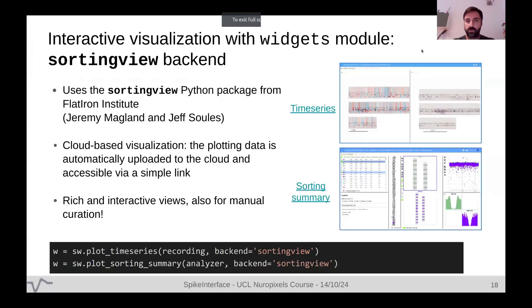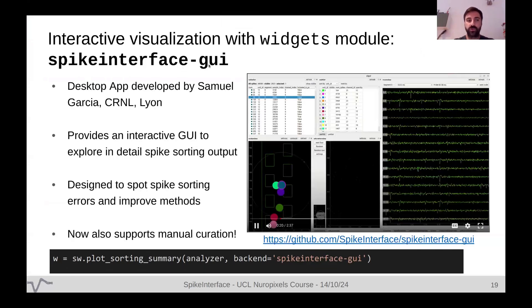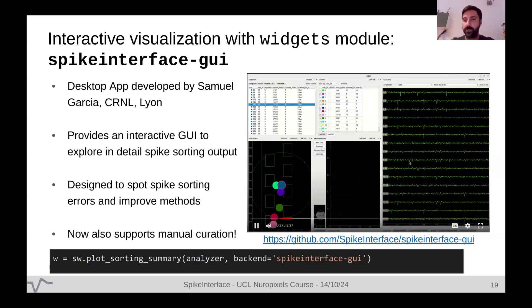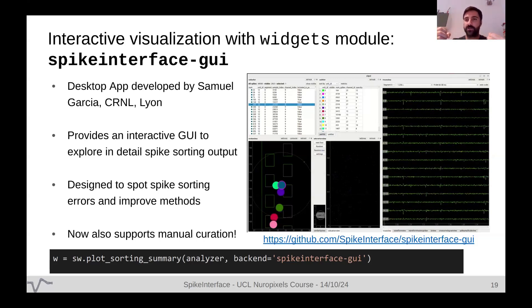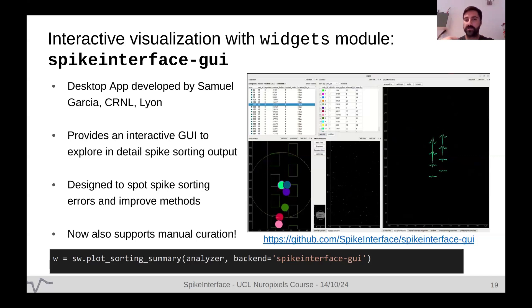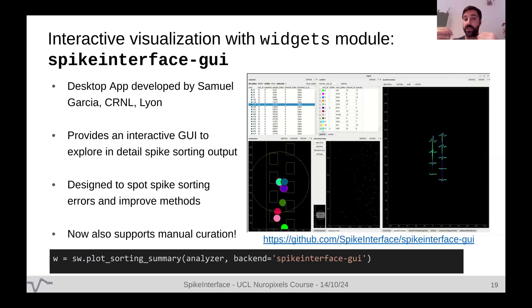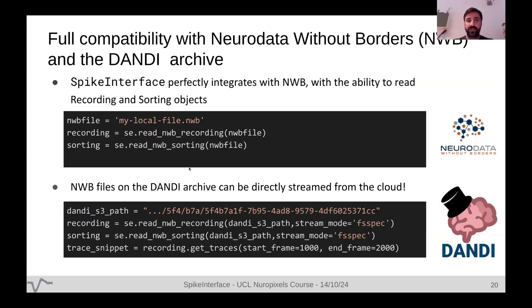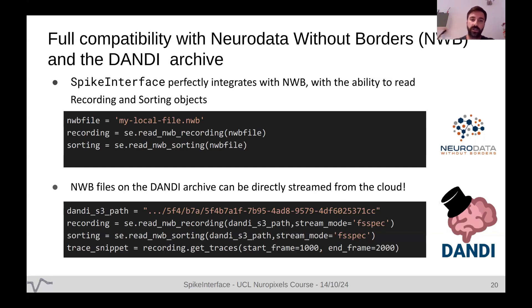We are also developing the SpikeInterface GUI — a desktop application similar to Phy but tightly integrated with SpikeInterface, allowing you to interact with all SpikeInterface functionalities, change parameters, and do manual curation. SpikeInterface is also integrated with Neurodata Without Borders, a standard for neurophysiology data — we can read recording and sorting data from NWB files. It's also integrated with DANDI Archive, an open archive for neurophysiology data, where you can stream data directly without needing to download it.